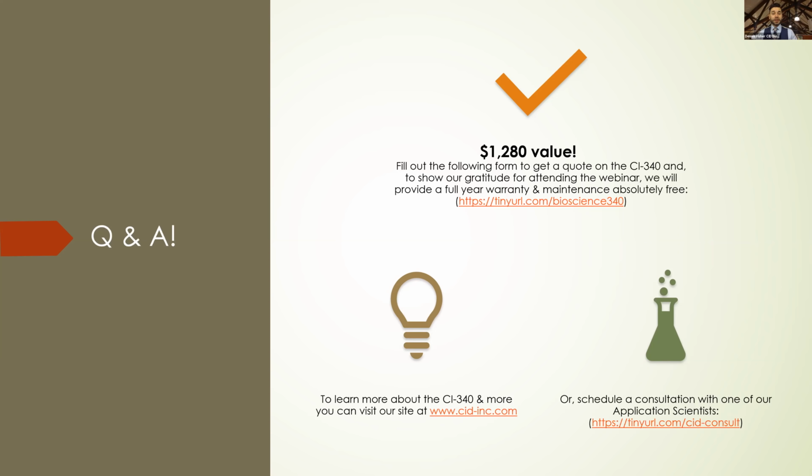The next one is, why not include a soil temperature sensor directly on your device to use with the soil chamber for soil respiration? With the soil chamber, you are getting the temperature of the soil, and that's why we created the chamber that way. When you stick it all the way into the soil, the sensor at the end is actually measuring that soil temperature. Of course, as soon as you take it out, it won't be working in that regard, but yes, it does provide that information.